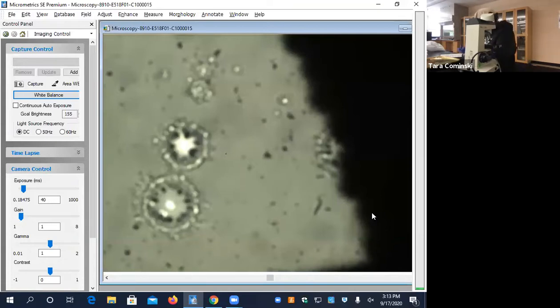I don't see that. Right, that black stuff on the side, that's just my little piece of the E. That's the only thing I can see now because it's so magnified. The field of view gets smaller when you go under higher magnification and you're making that image bigger. So you can't see the whole E anymore, because now you zoomed in on one little part of the E. Make sense? So you're probably just going to draw some black shading on one side or something like that, and then write in what the magnification is.